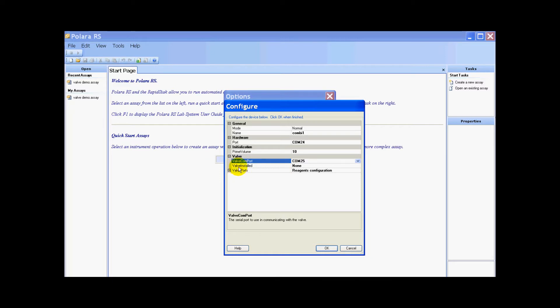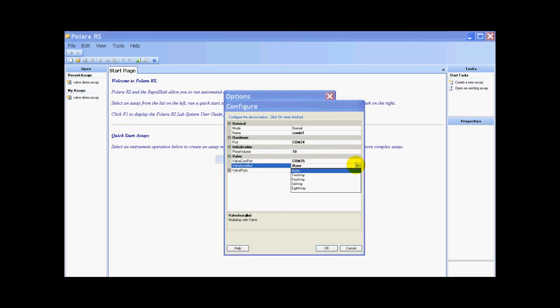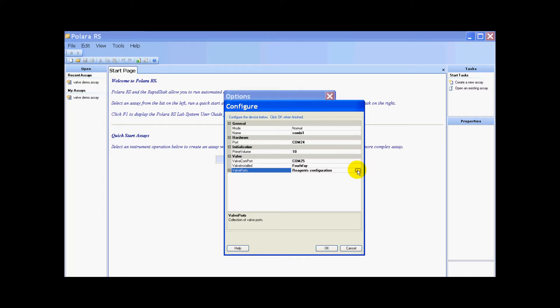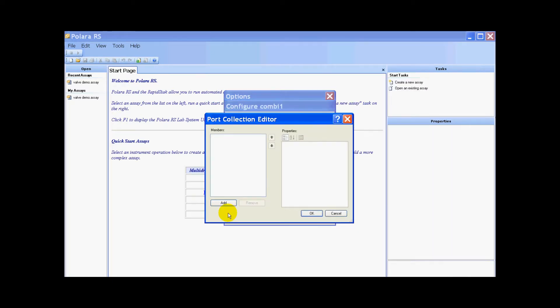Now it's asking if the valve is installed. Right now we have none. I'm going to say I have a four reagent valve selected. Under ports, I have to configure my reagents to the various ports. I click on this little box with three dots. On our port collection editor pop-up, this is where we're going to add and configure our various valves and reagents.